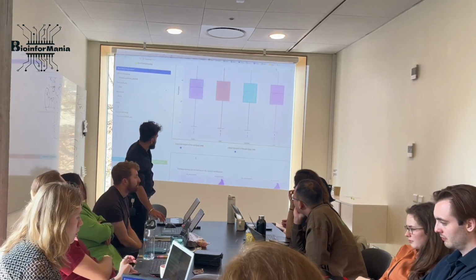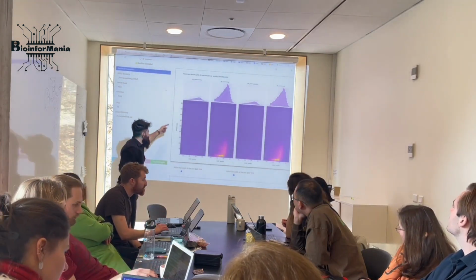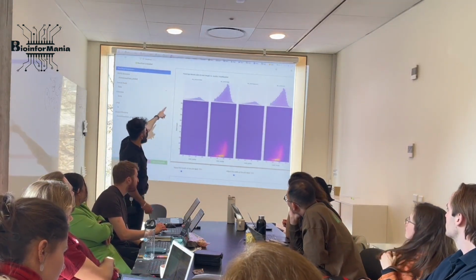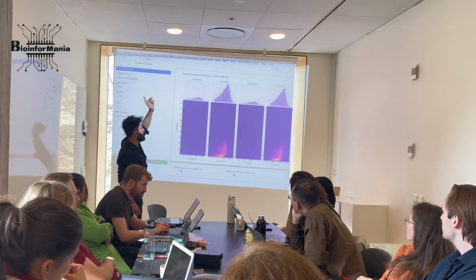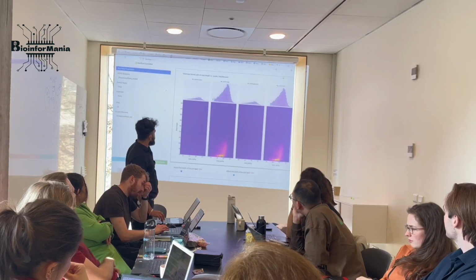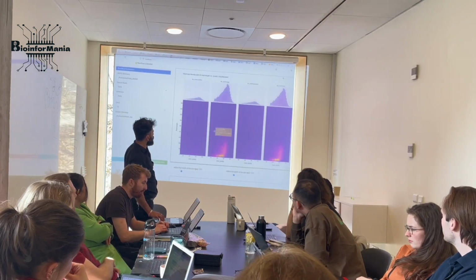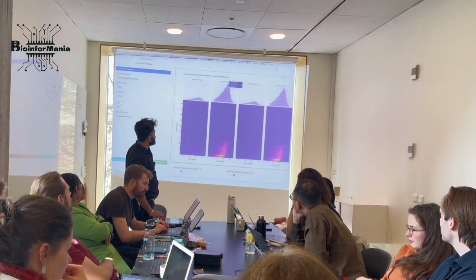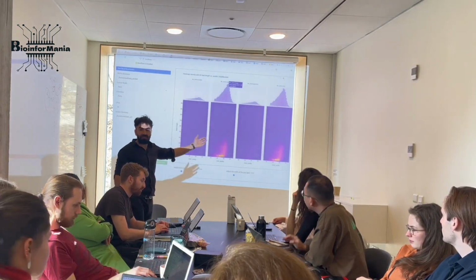Okay? All with me. Here is interesting to look at. This is per genome read length against read quality. So all those reads that are in each genome, like the first one is called annotated, I just named it. The other one is a large genome, the other one is genome 1, and the last one is called new genome, okay? So what you can read from here, this is the histogram of your read quality, which the mean and median is about 19.5 to 20, which is great. And it has 6,512 reads with this quality, and that's great, okay?